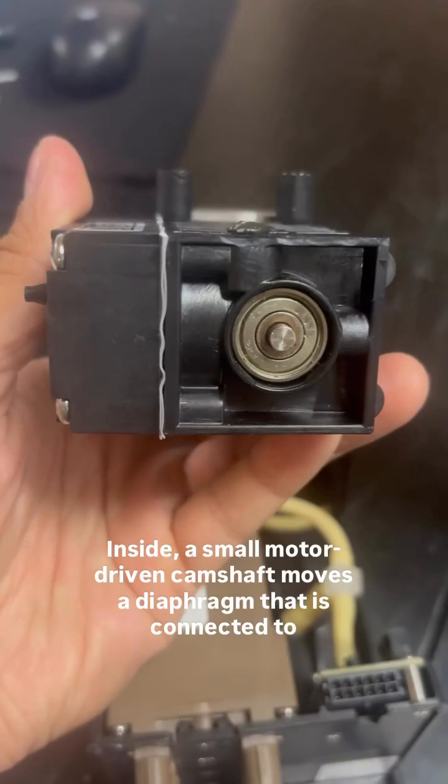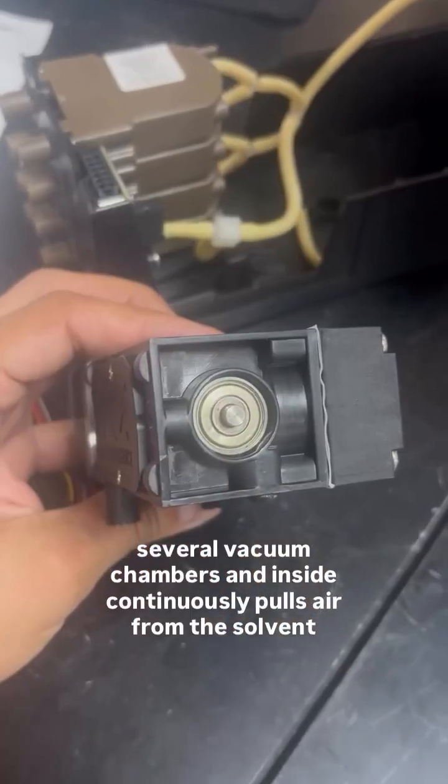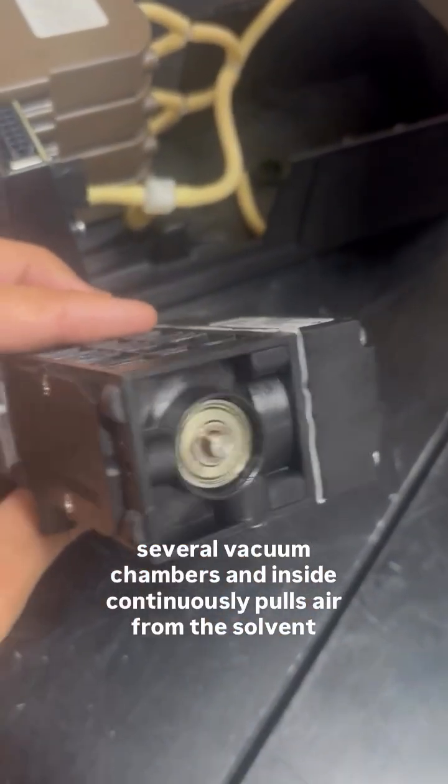Inside, a small motor-driven camshaft moves a diaphragm that is connected to several vacuum chambers, and continuously pulls air from the solvent lines.